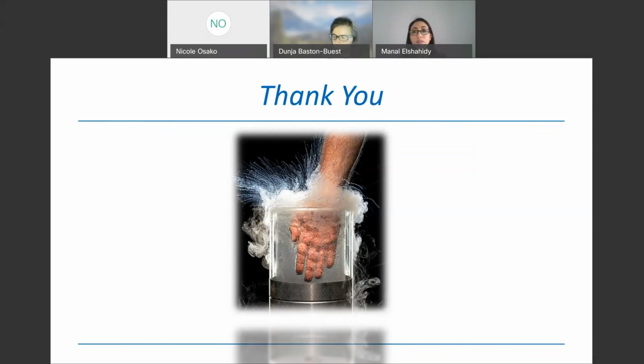Do you recommend storage in liquid nitrogen or above for vitrified probes? We really store the vitrified samples in the liquid nitrogen phase, and we try to have about 80% filling in the tanks all the time, so a minimum of 80% filling level.